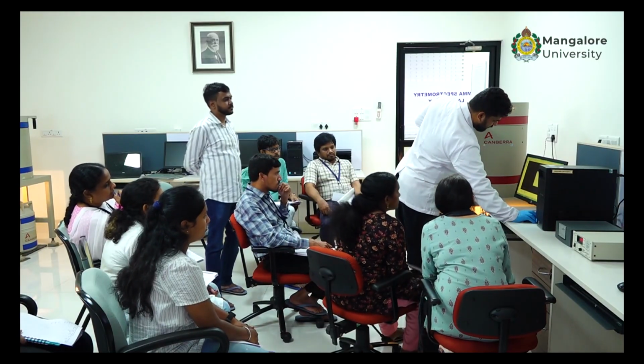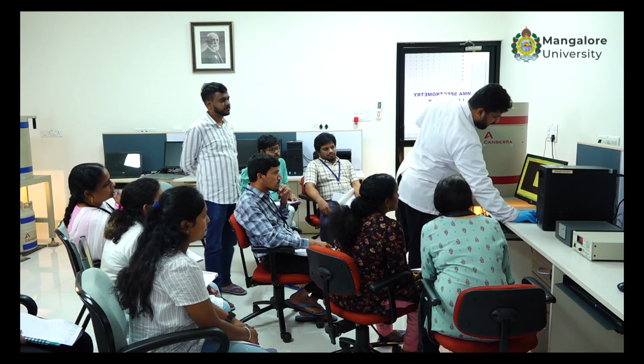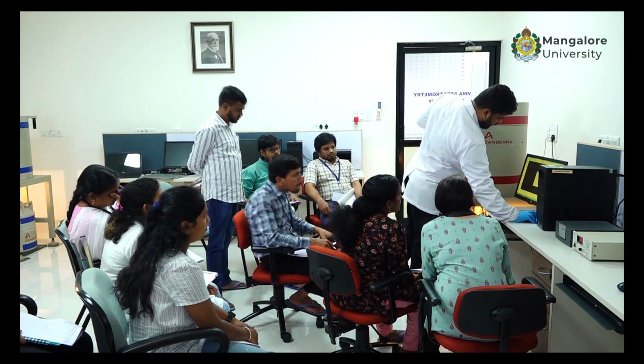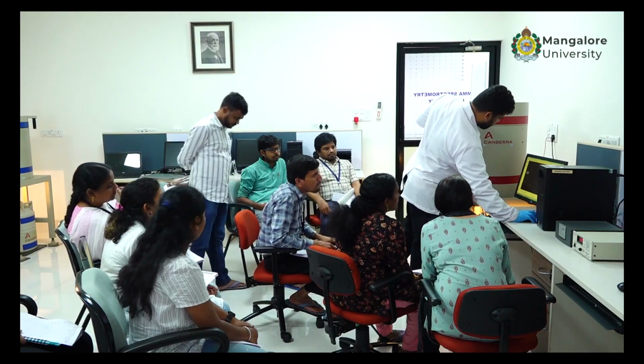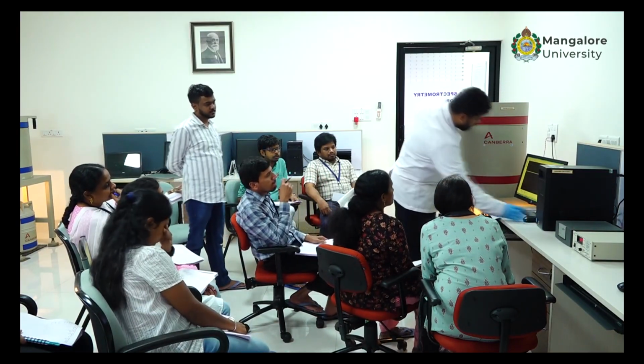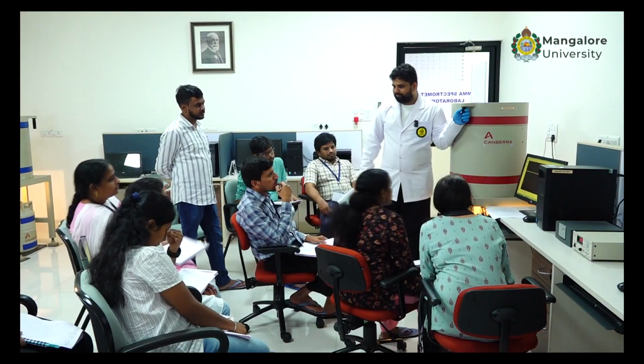You don't have to give start or something. No. It is background, unless I stop it, there is no problem. So display. This is previously analyzed one. Yes. So the floor is for you.